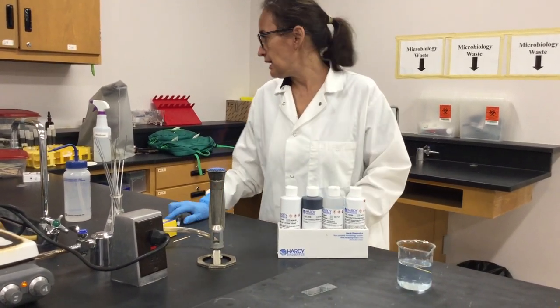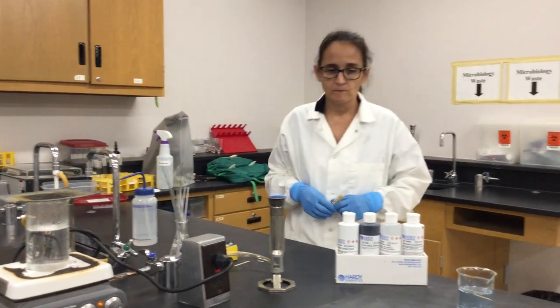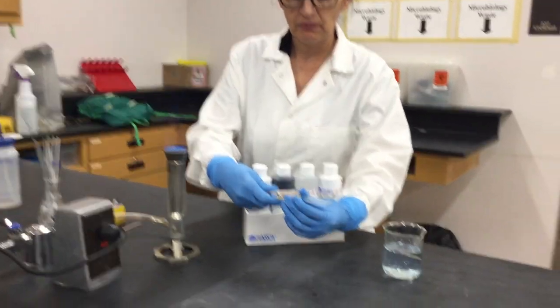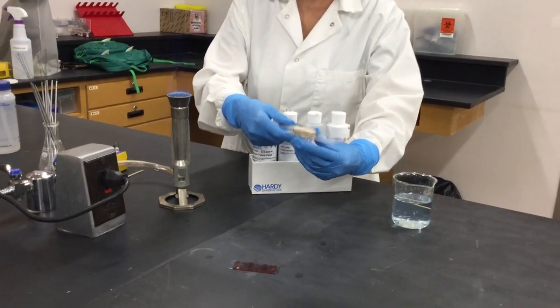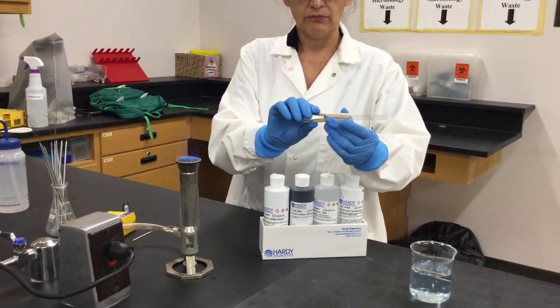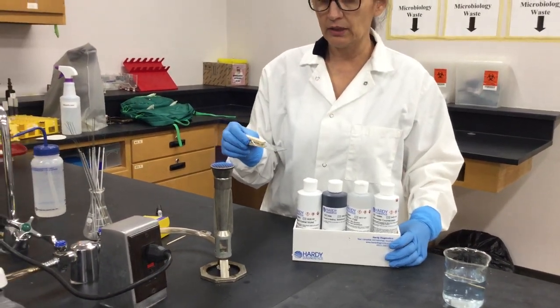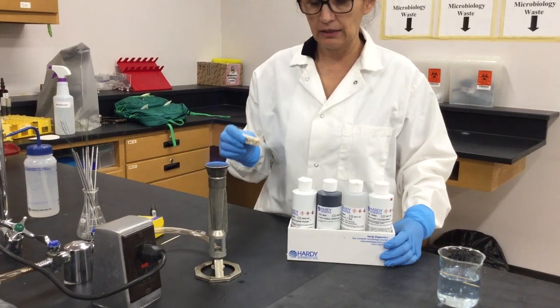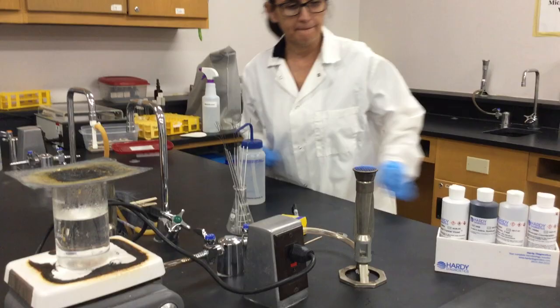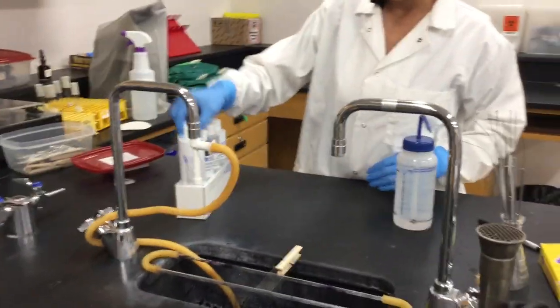Now this last slide is almost done. Let me grab a clothespin. I think it's ready to be fixed. So you grab the slide by one edge, and then you just clamp the clothespin here, pass it twice quickly through the flame, like this, put it here in your rack for staining, and then start adding your reagents.